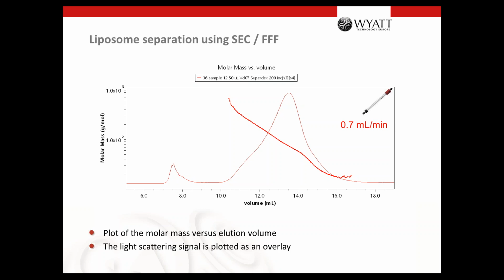When we do that with a flow rate of 0.7, which was the flow rate the customer usually used, you see 3 peaks. There's one shoulder here, which has a different molar mass behavior on the column. Then we have the main peak here, and another shoulder here, and some very big aggregates on this side. That looks quite normal, and the customer was happy with that.